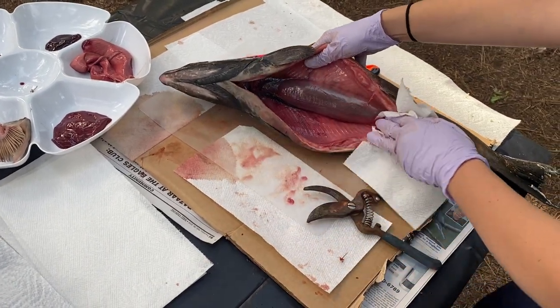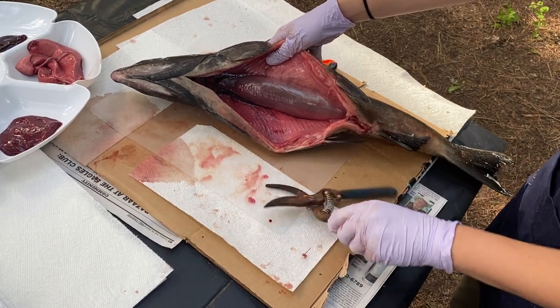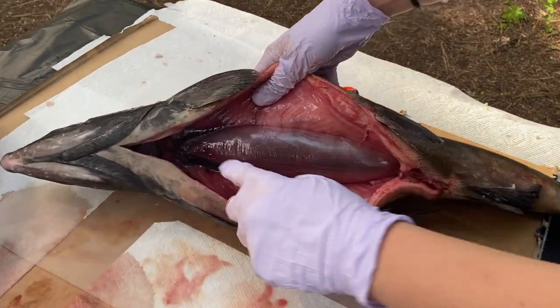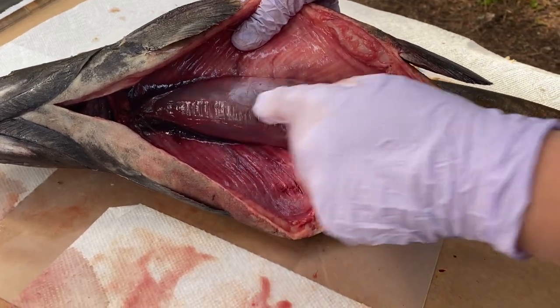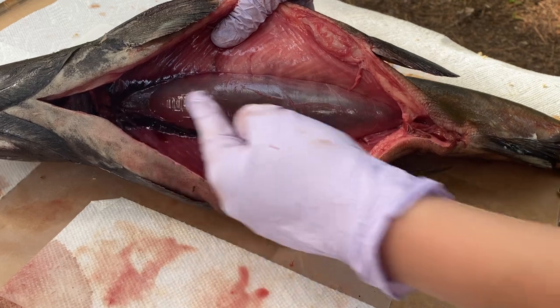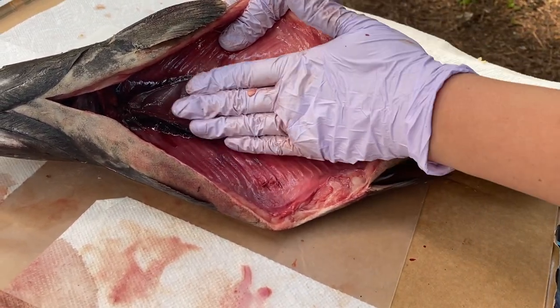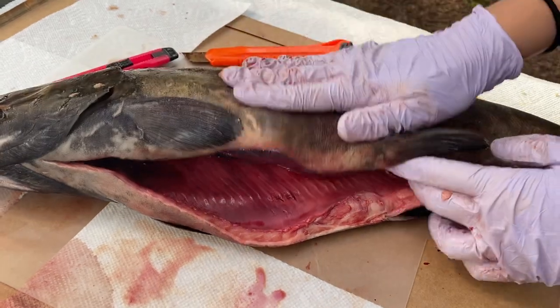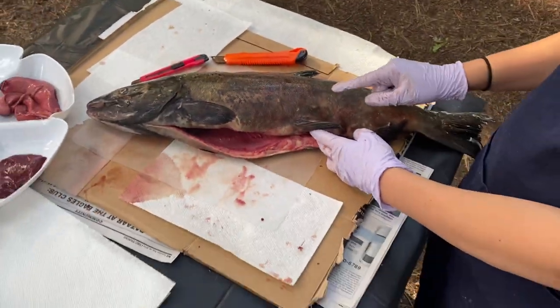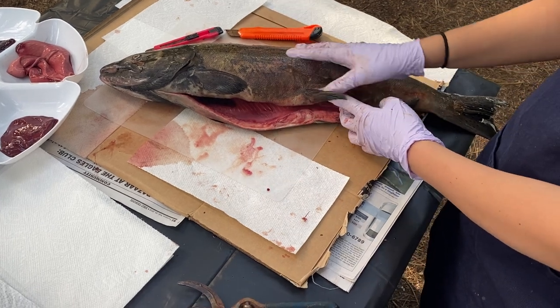And then I think one of the coolest parts of the salmon is right here. This balloon structure is exactly what it looks like. It is a giant balloon inside a fish's body, and this is called the swim bladder. The swim bladder runs throughout the whole back of the salmon, and it's filled with air, and it can change the pressure of how much air is inside of it. You have to think about how fast these guys can swim through a water column. They can be really deep down inside of a big pool, and they can swim all the way up to the surface to catch a fly.